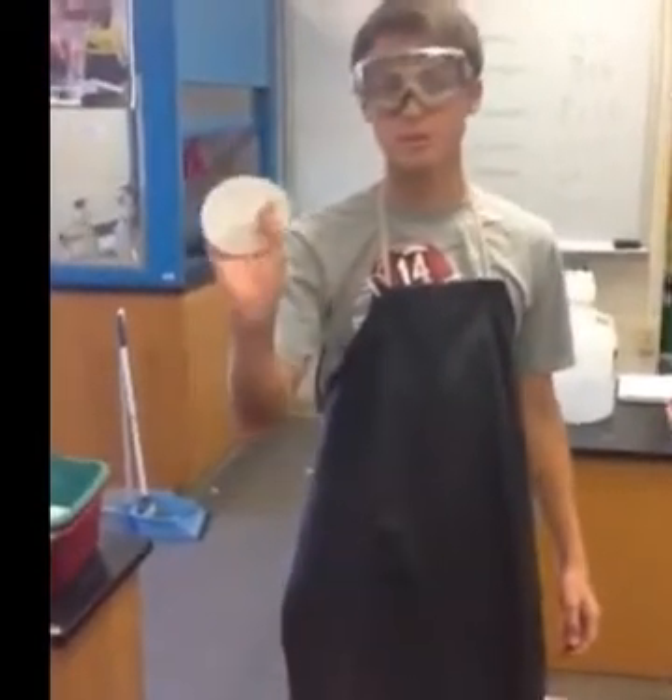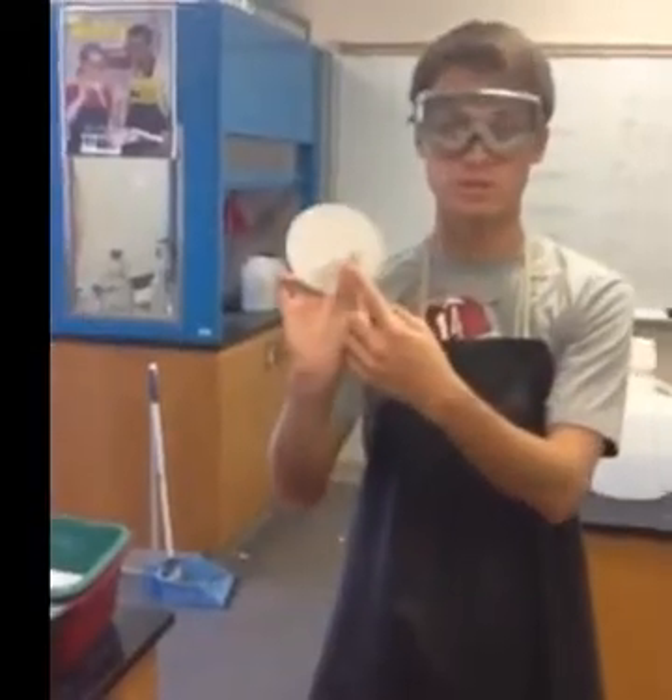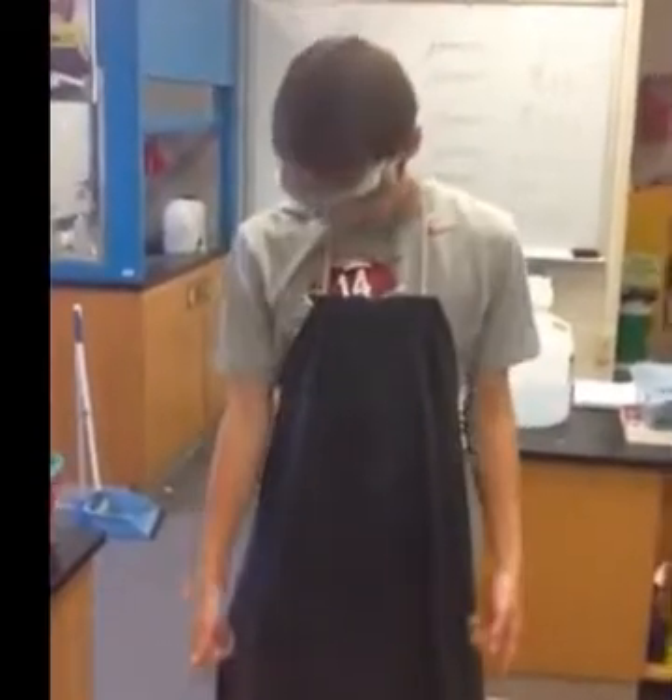So before you get started with gravity filtration, make sure you have a filter paper with your name on it in pencil — don't use pen, use pencil. Also make sure you have your regular lab safety stuff: close-toed shoes, an apron, and some goggles.